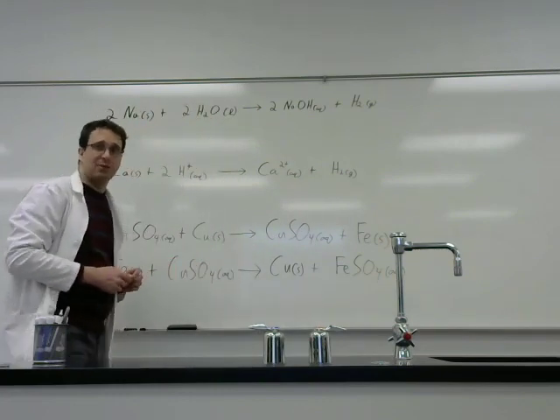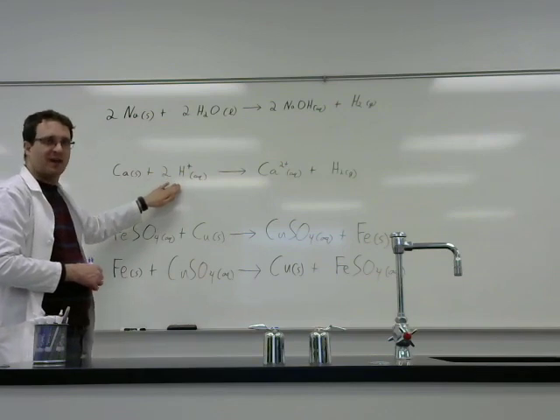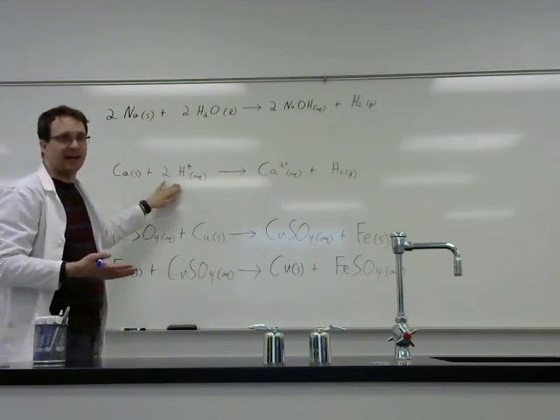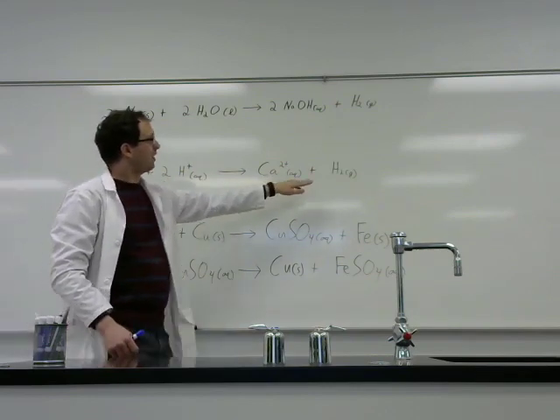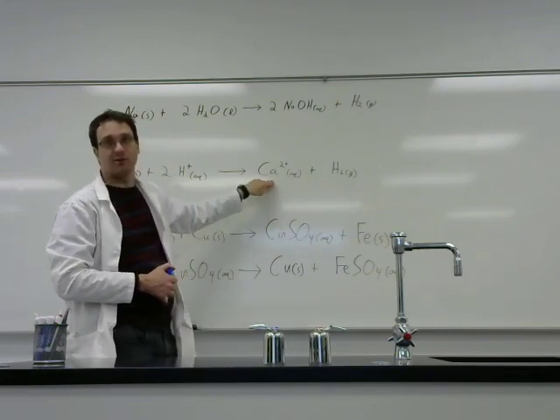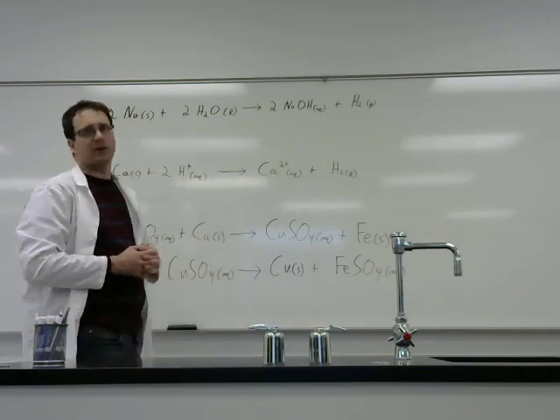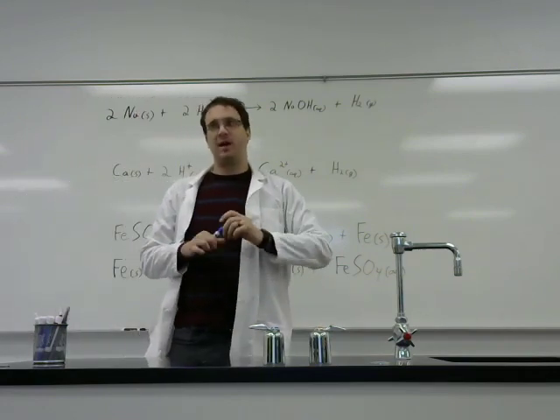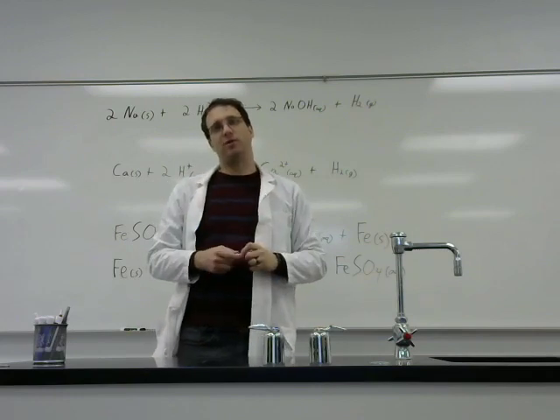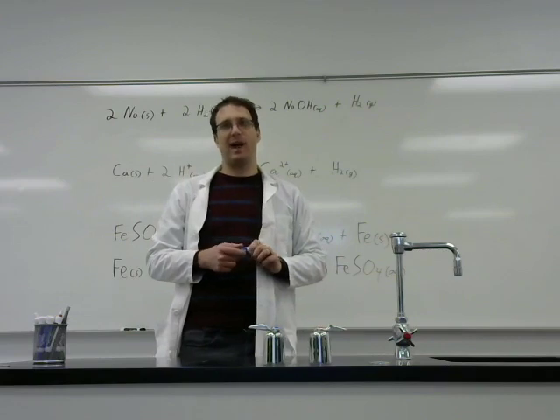Now in this case you don't make a basic solution, but you do consume H+, and so the solution will be less acidic at the end. And again, it generates hydrogen gas, and the metal is turned into an ion. It's been oxidized.